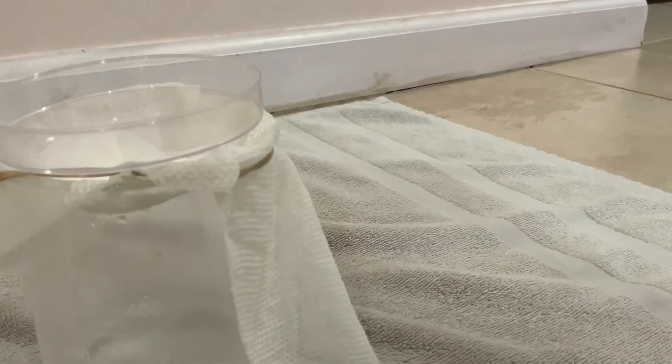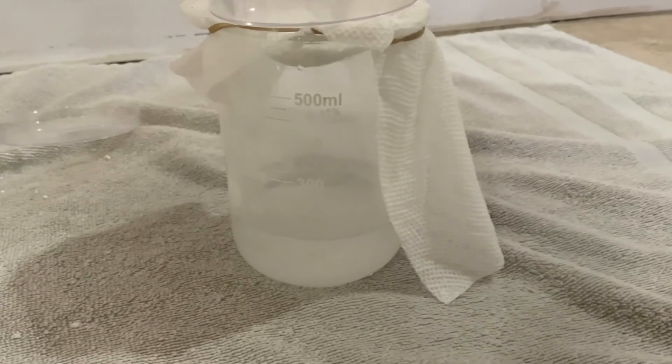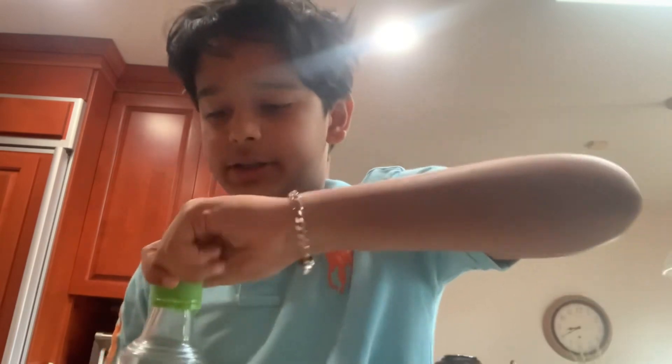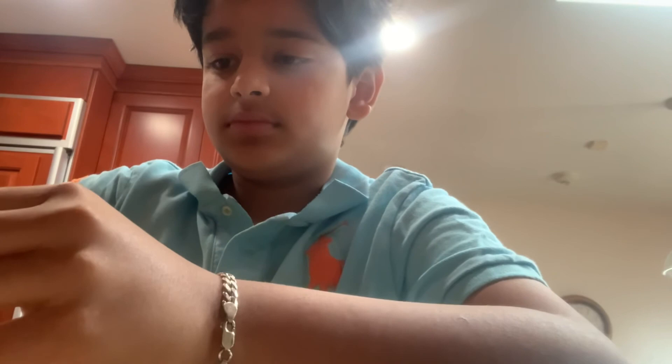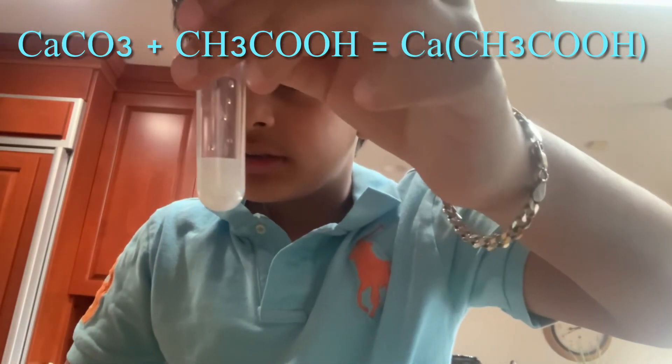I'm going to look at the reaction — it's right on this paper. Baking soda plus calcium chloride equals calcium carbonate. You can tell baking soda is basically sodium bicarbonate and this turns it into calcium carbonate. I took a little bit of calcium carbonate to see if it's really calcium carbonate and put vinegar on it. And it should react. And it's fizzing!